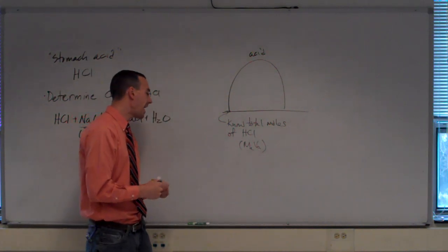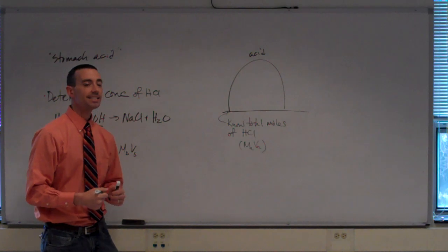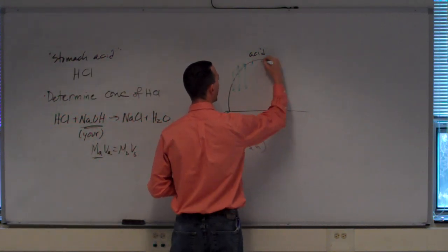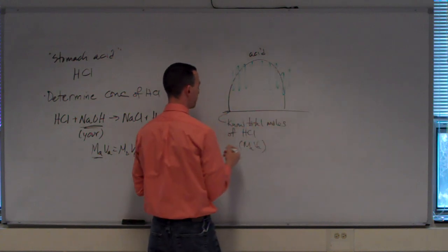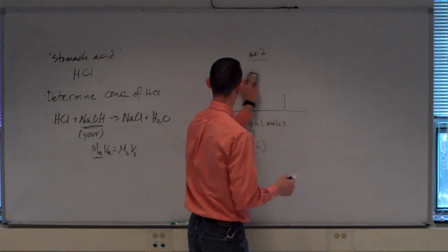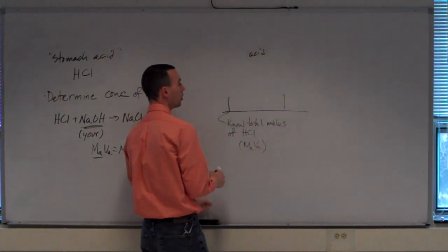You will then add the antacid to it. The antacid will dissolve or react away a large portion of it, eliminating a bunch of it. But some will be left over.